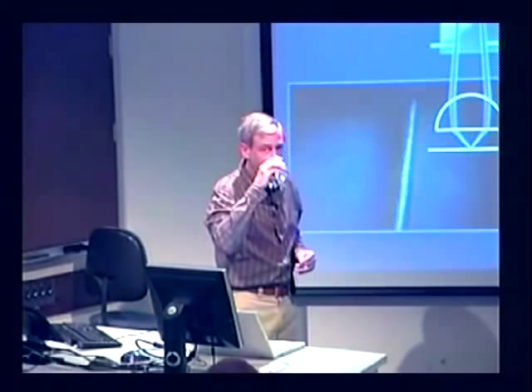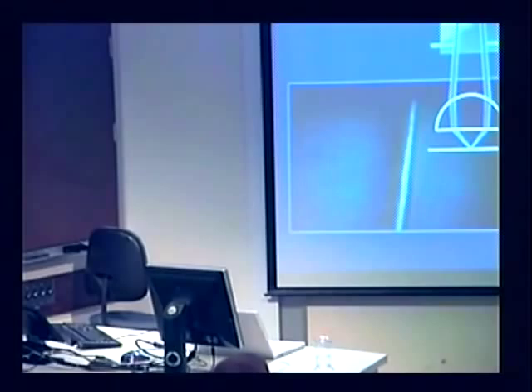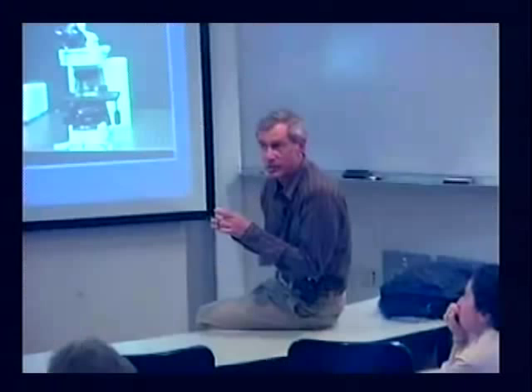Down here. I have to admit, I'm dissatisfied with the loss of resolution because of, you know, nanometer scales and all of these things. Is there some way, I'm racking my brain, larger lenses, just to increase the number of samples that you're taking or something? Yeah, all right, so let me give you a couple of ideas. So one thing you can do is move the lenses sideways by, let's say, half of the lens width and do super resolution in space.